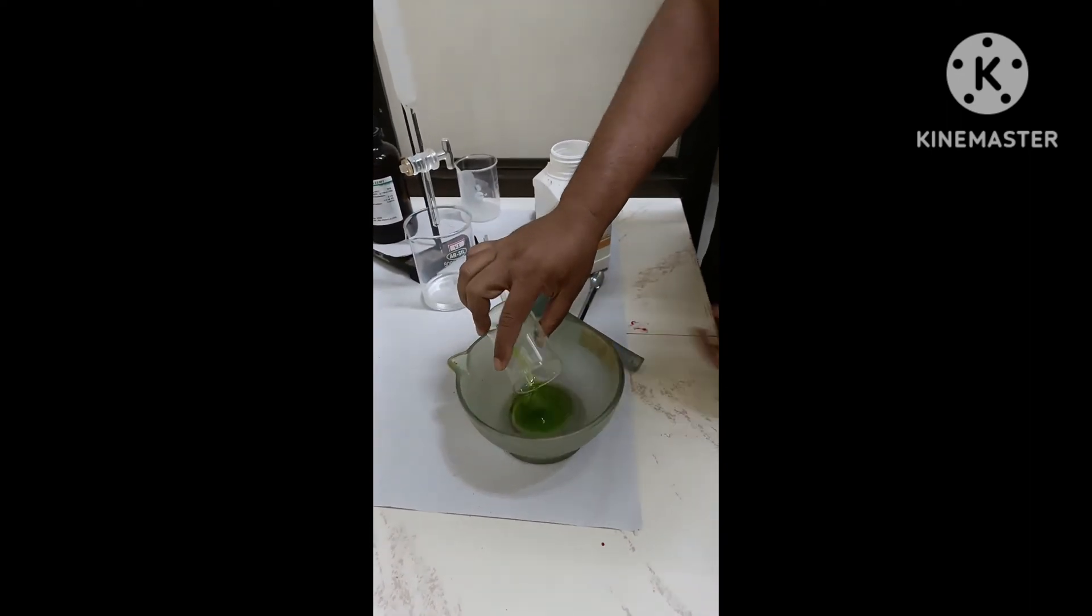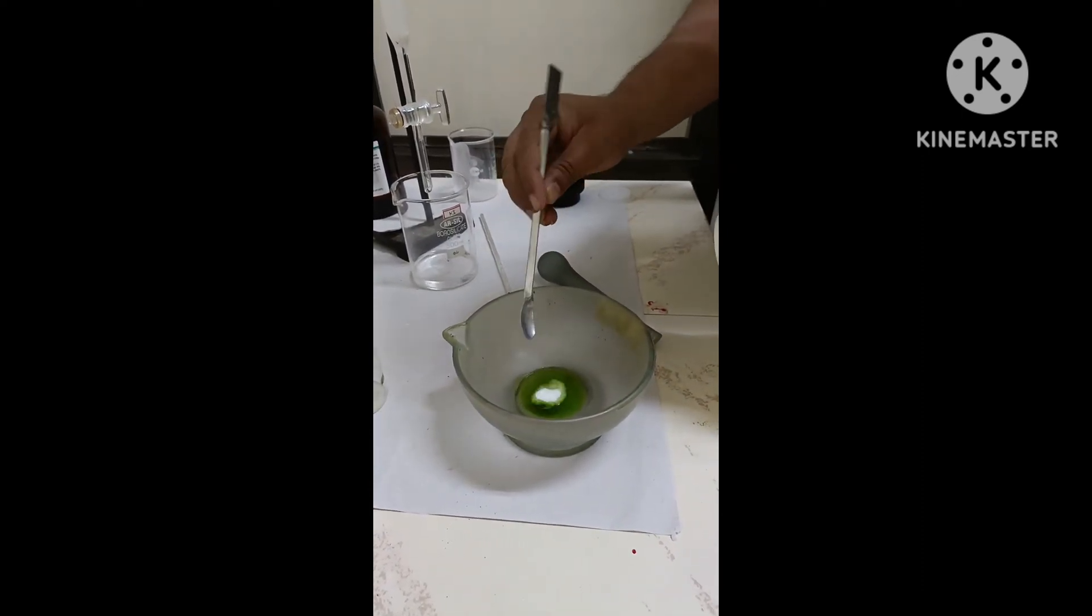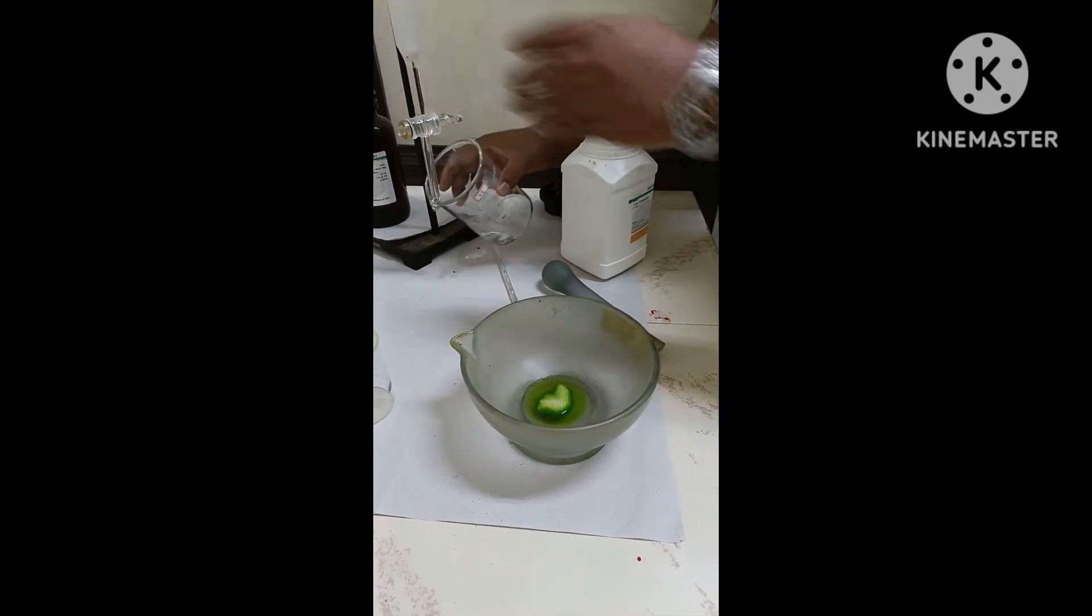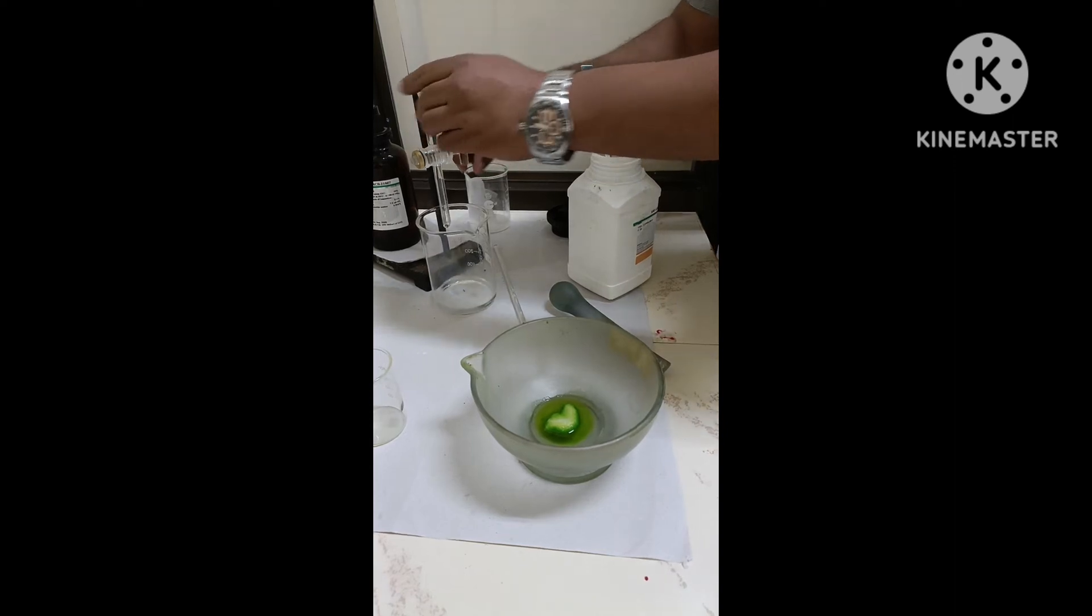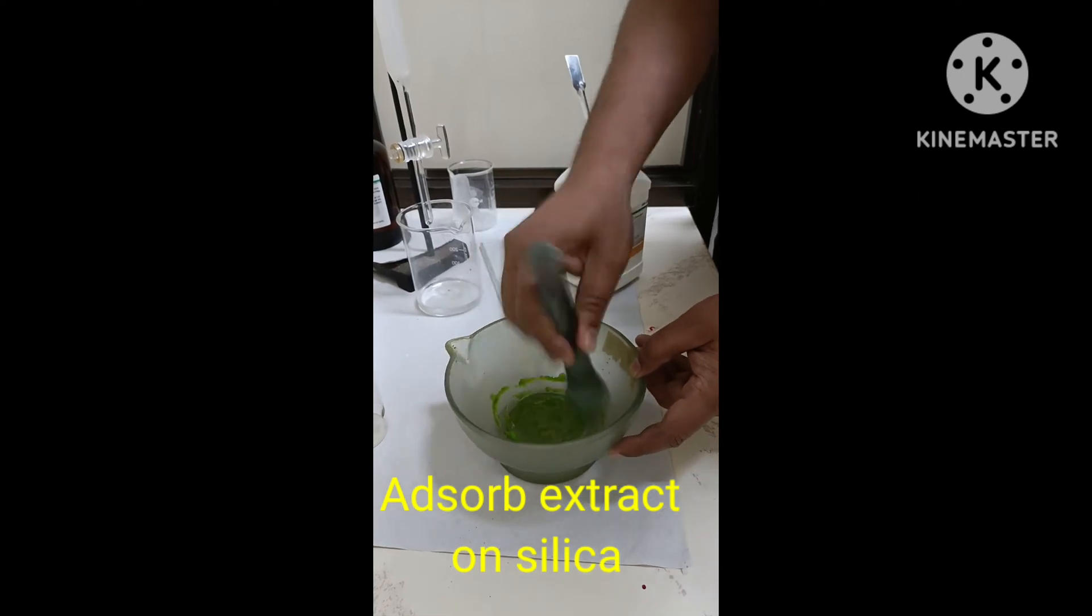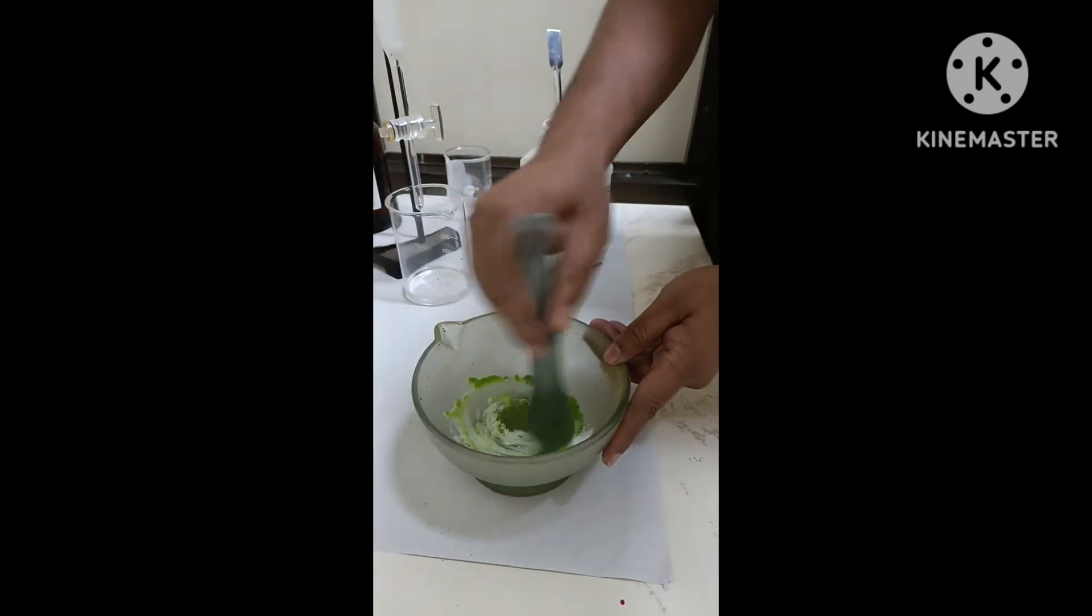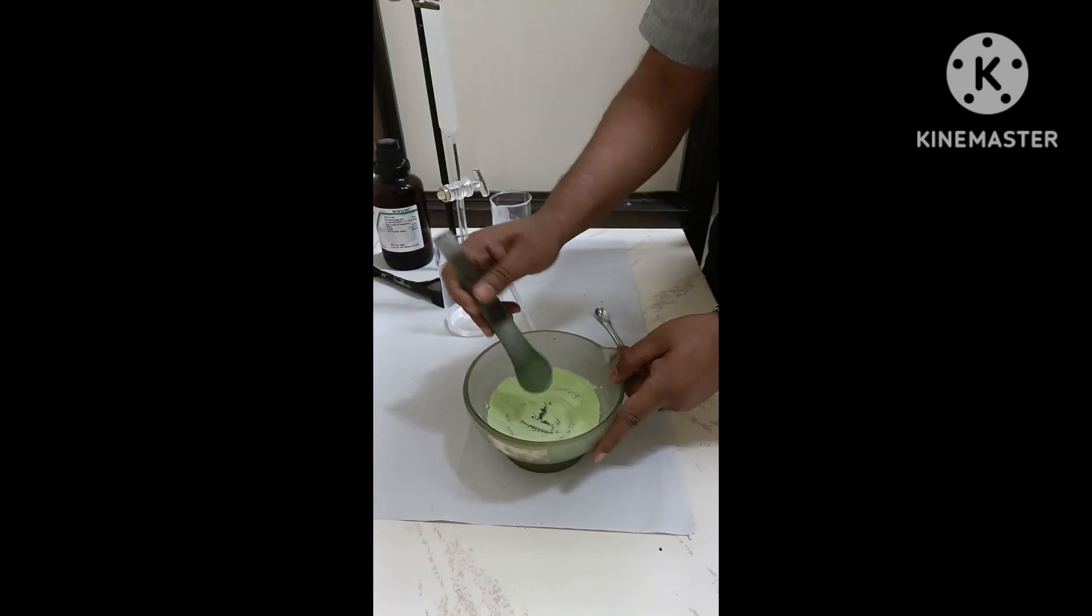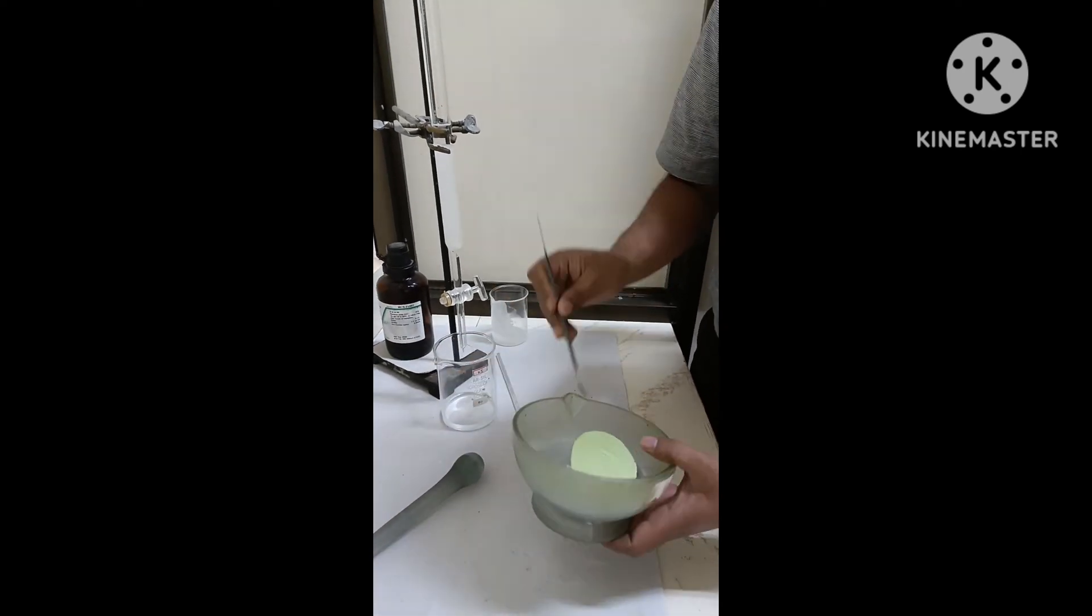We can filter out and then you can see what we got is the extract which is free from moisture. Now, what we need to do is adsorb this extract on the silica, so we added a little amount of silica into that. Sometimes some people prefer to directly use the liquid sample and sample is loaded using the liquid form. But it is always better to adsorb that on the silica so that when you load the column with the sample, it will not disturb the packing. This is how we can adsorb.